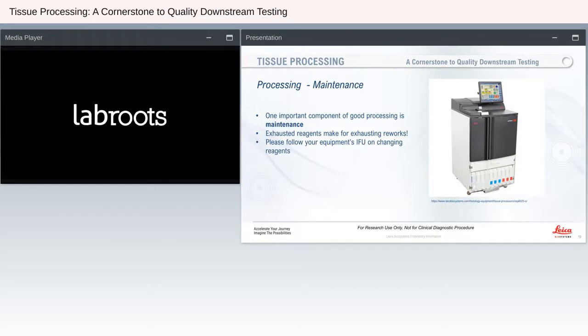One item that's sometimes overlooked due to the busyness of the lab is maintenance. I will tell you there are many artifacts that you will see on your H&E, on your IHC, that will go back to the root cause of maintenance on the processor.